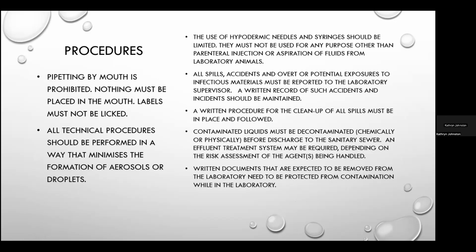Mouth pipetting is strictly prohibited. And in fact, nothing should be done by mouth in the lab work area. This includes tasks such as licking labels. So any labels that are used in the laboratory should be self-adhesive. And because of the risk of disease transmission by droplet spread or airborne spread from aerosols, procedures should be done in a manner which minimizes the formation of droplets or aerosols.